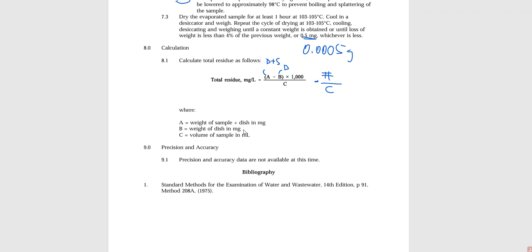Excel, in a proper lab environment, Excel will do all the work for you. Here, you're going to have to kind of tell Excel what you want to do with the numbers. We're forcing you to walk through the calculation yourself. And that will give us our value in milligram per liter, aka parts per million, which is ppm.